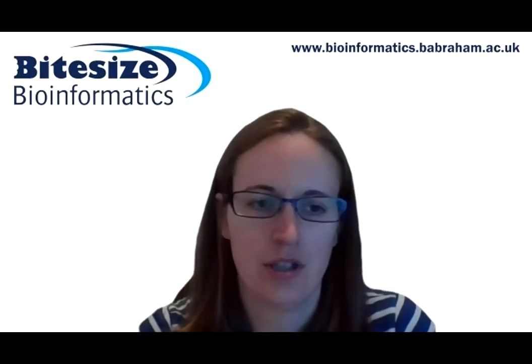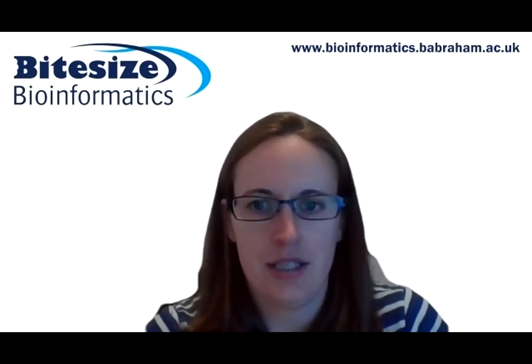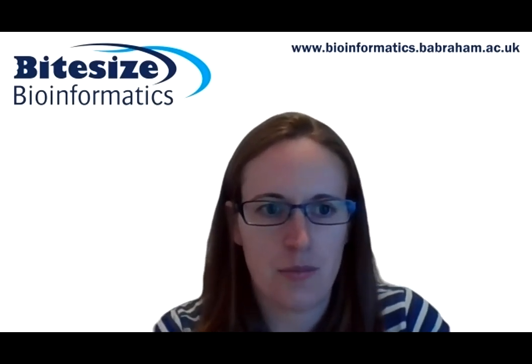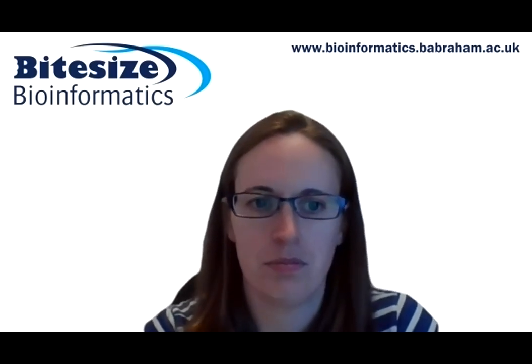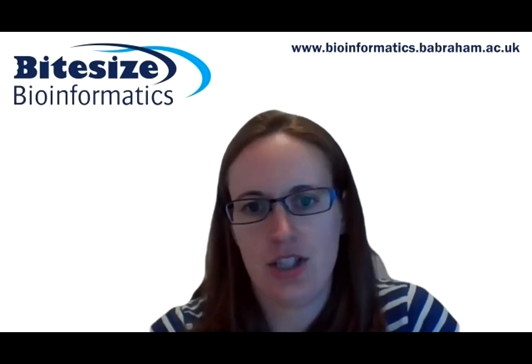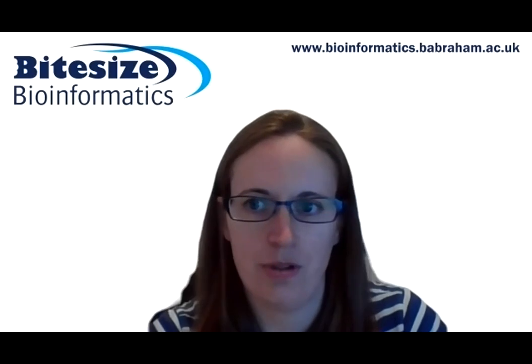So the type of functional analysis that I'm covering today essentially involves taking a set of genes, preferably around a few hundred, from the output of an analysis. They may be genes that have been identified as differentially expressed between conditions or the output from another statistical test. And then we test these genes to see whether they are enriched for particular biological functions.